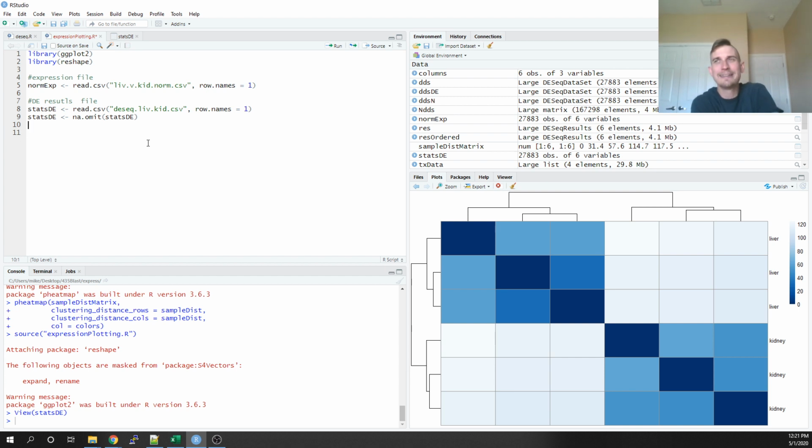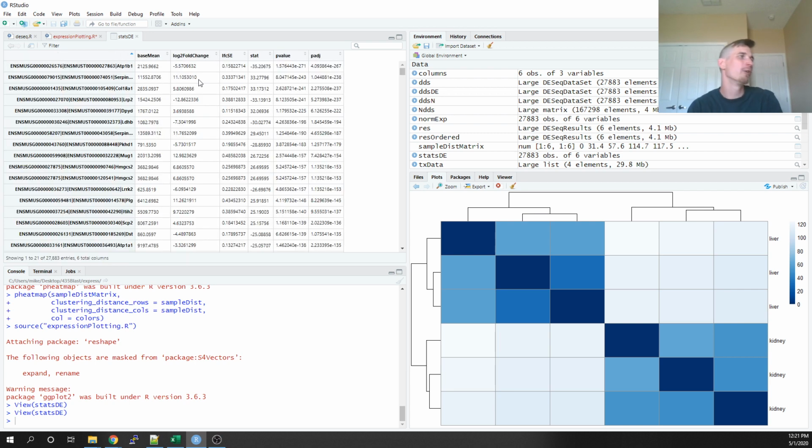And also I want to define a variable. I have my p adjusted. I know if my p adjusted is below 0.05, it's statistically significant. If not, then I know it's not. But trying to make ggplot do that without changing the table is a little bit tricky.